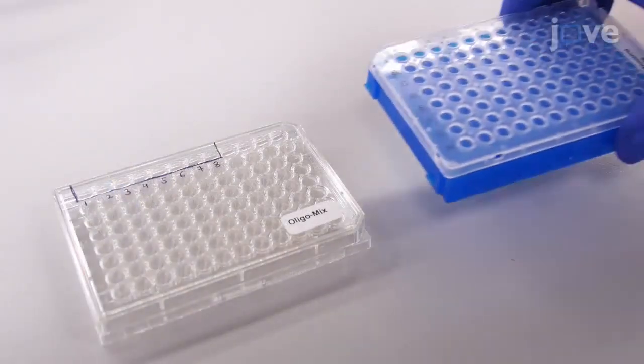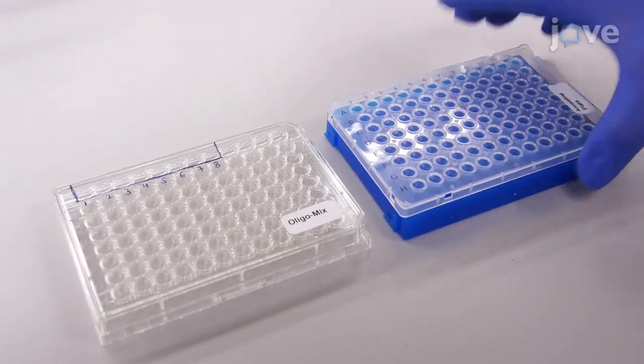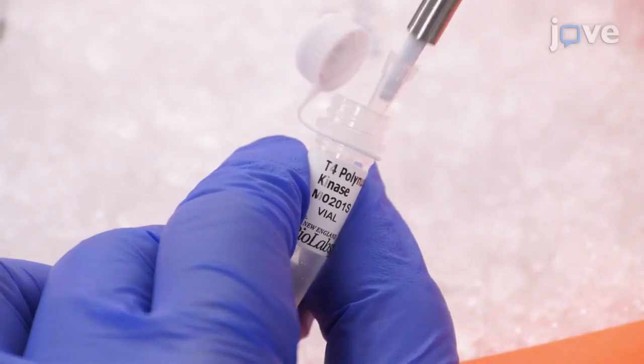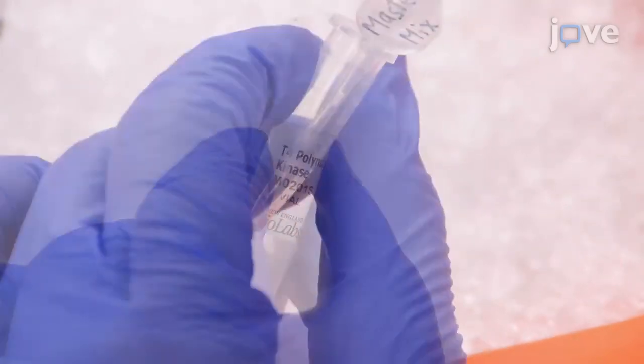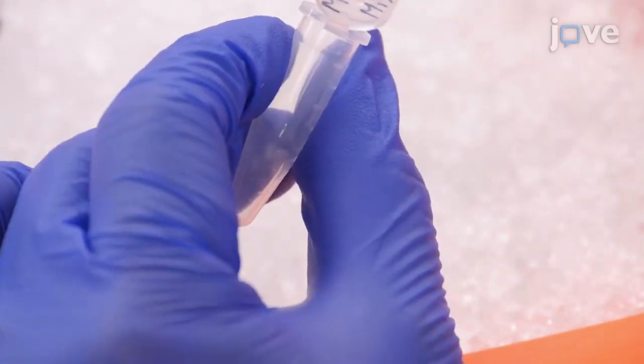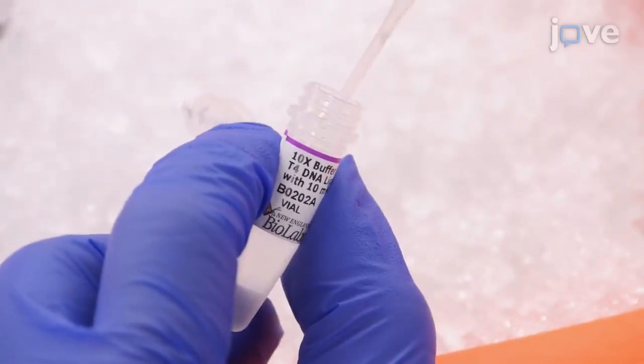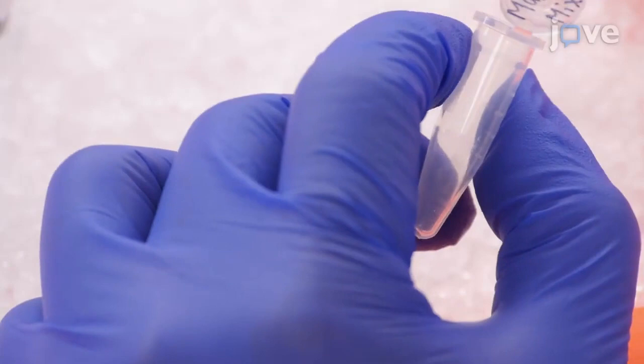Set out a separate U-bottom 96-well plate labeled annealing plate. Prepare a master mix of 1 µL of T4-polynucleotide kinase, 1 µL of 10X T4-DNA ligation buffer, and 6 µL of water per annealing reaction.